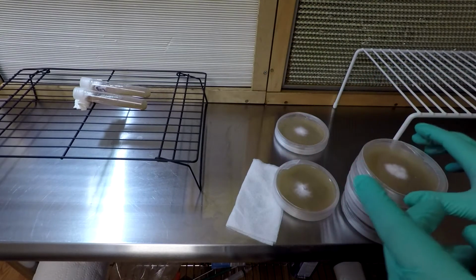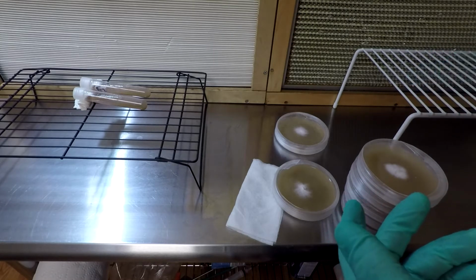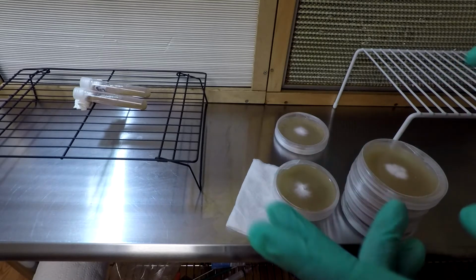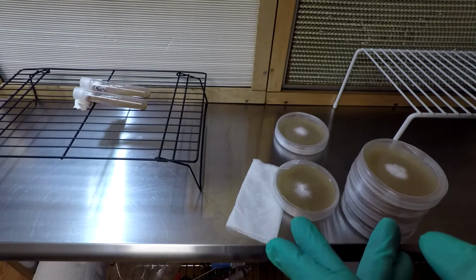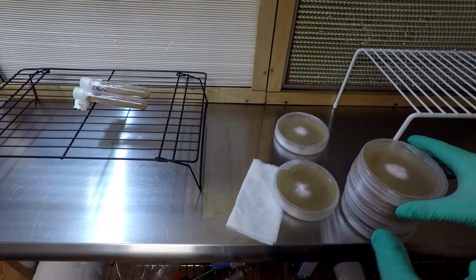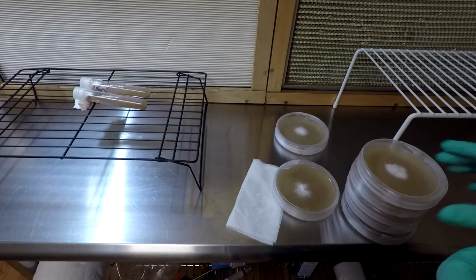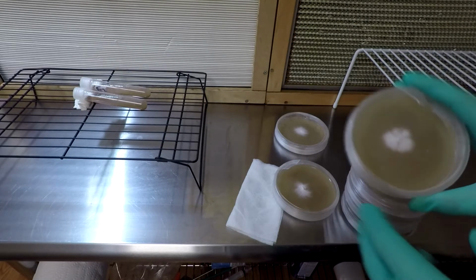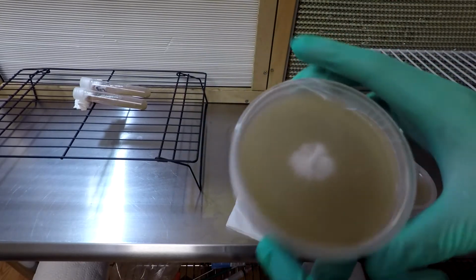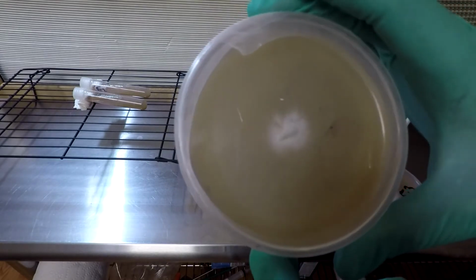Okay, what I'm looking for is how thickly the mycelium is running, how thick and cottony white it is, how far it's grown compared to the other dishes in the short amount of time, because I've tried to cut the individual transfer pieces the same size so I get an idea to compare them. See, this one's pretty cottony too. Not as much radial growth. Same, pretty much.